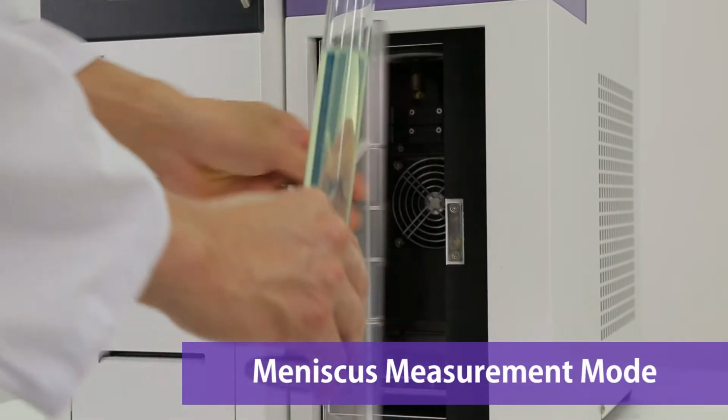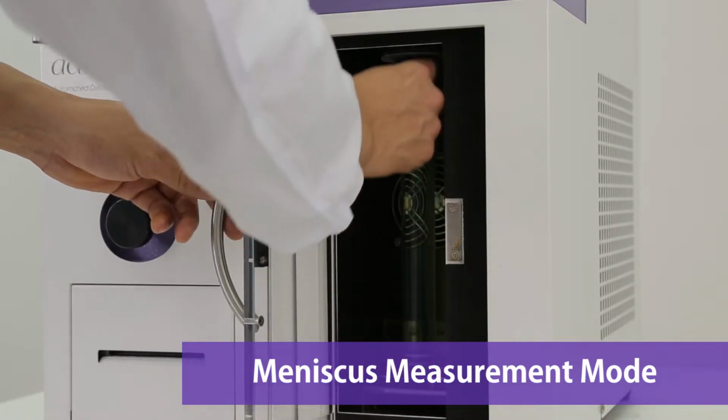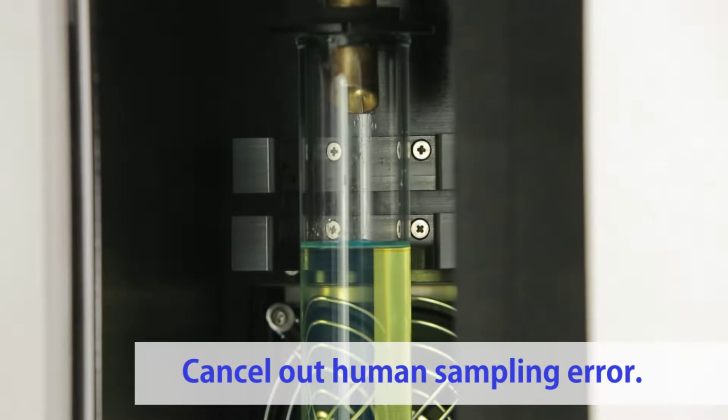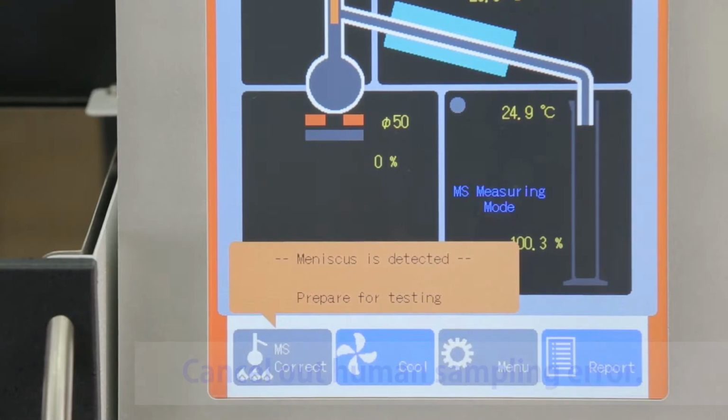The ad7 is equipped with a meniscus measurement mode. After placing roughly 100 milliliters of sample into the cylinder, this mode will measure the exact liquid level and define that level as 100%. This function is especially useful when sufficient sample is not available.